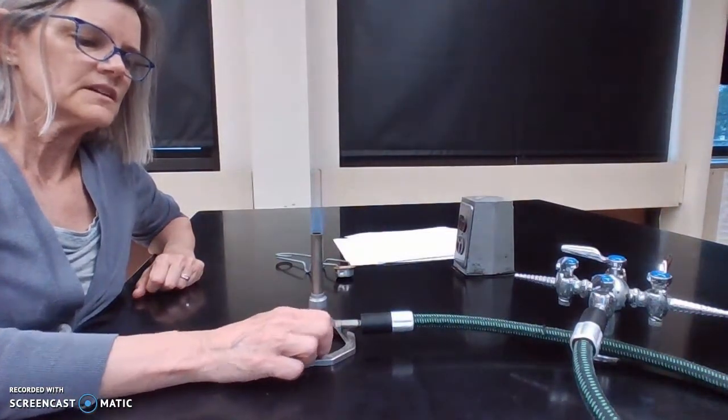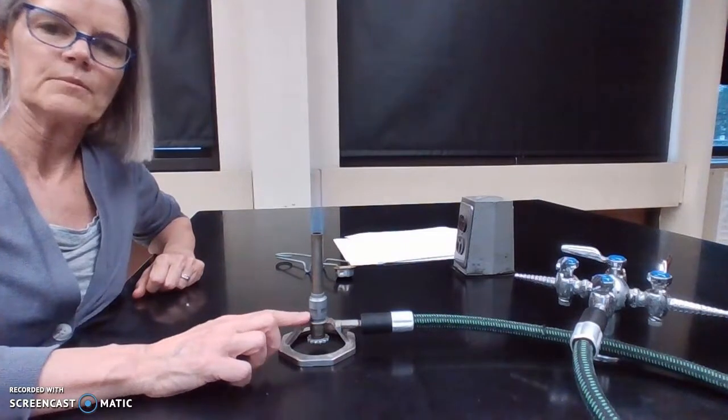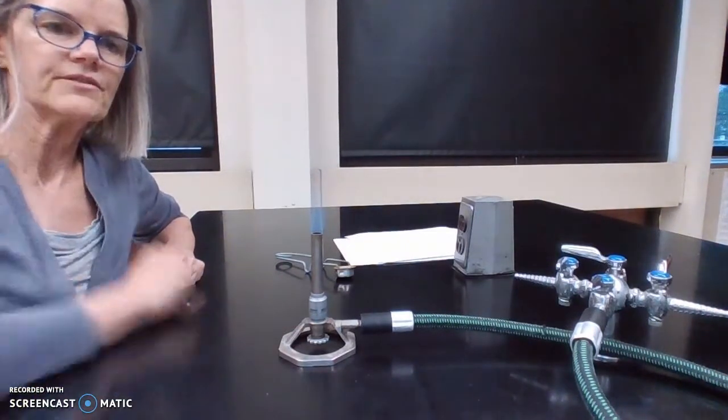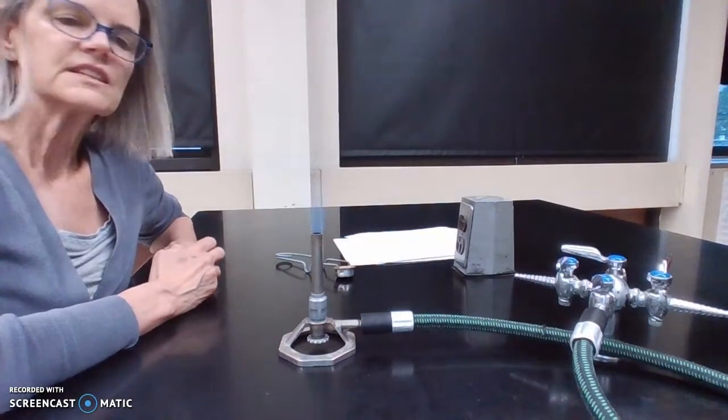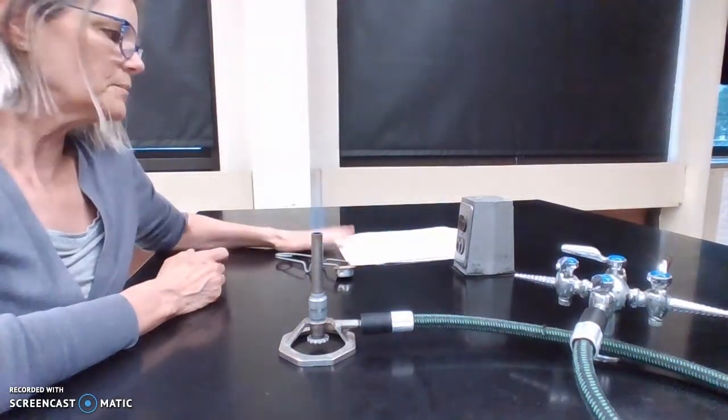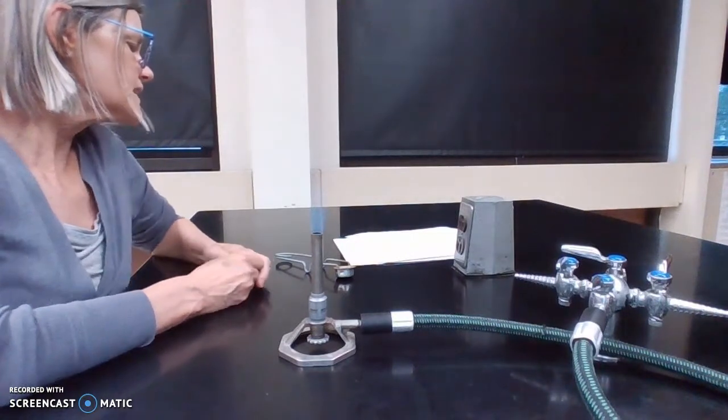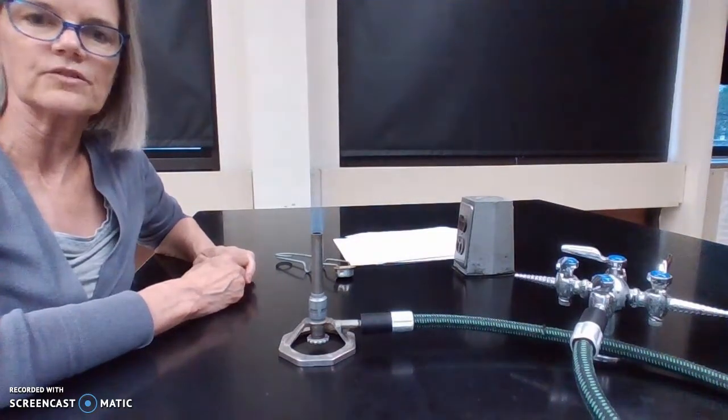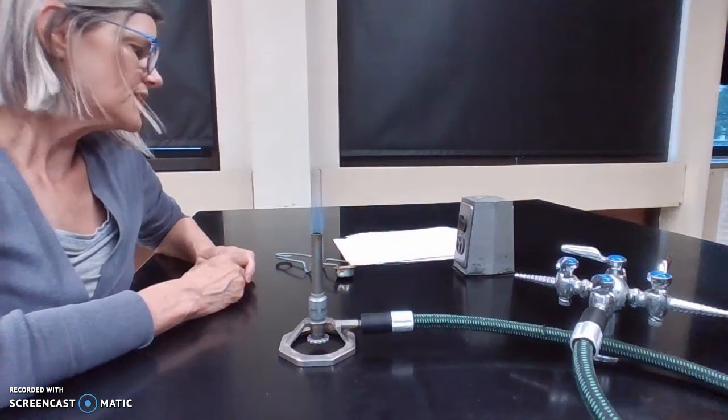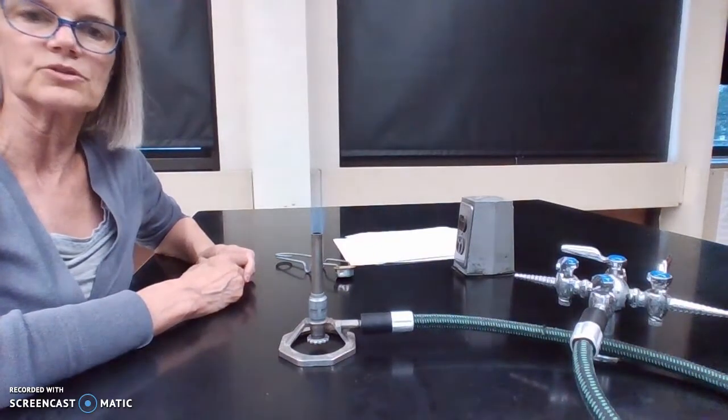So balance the needle valve and the air port to get the right height of the flame and the right quality of the flame. There's a table associated with the lab book on the Bunsen burner, and it asks you just that. What's going to happen if the needle valve is open too much or if it's closed too much? What happens if the air port is open too much or closed too much?